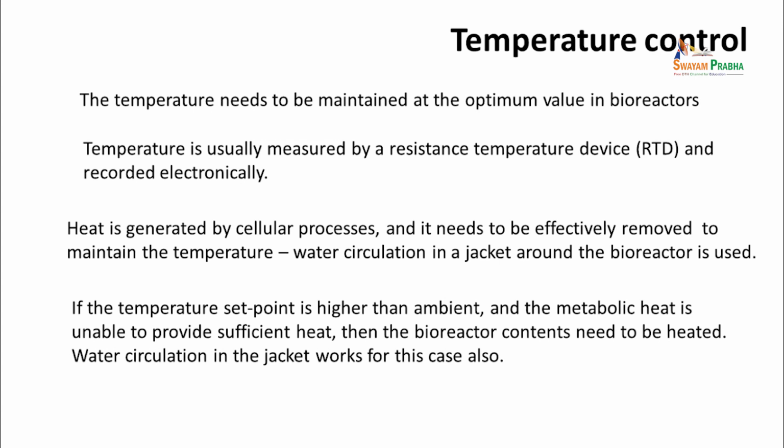If the temperature set point is higher than the ambient, let us say 37 degrees C is definitely higher than the ambient, and the metabolic heat is unable to provide sufficient heat to maintain temperature, then the bioreactor contents need to be heated. Okay? The water circulation in the jacket again works for this very effectively.